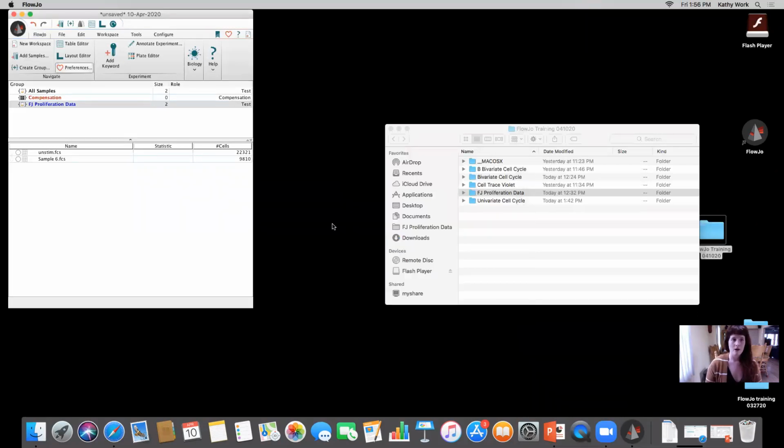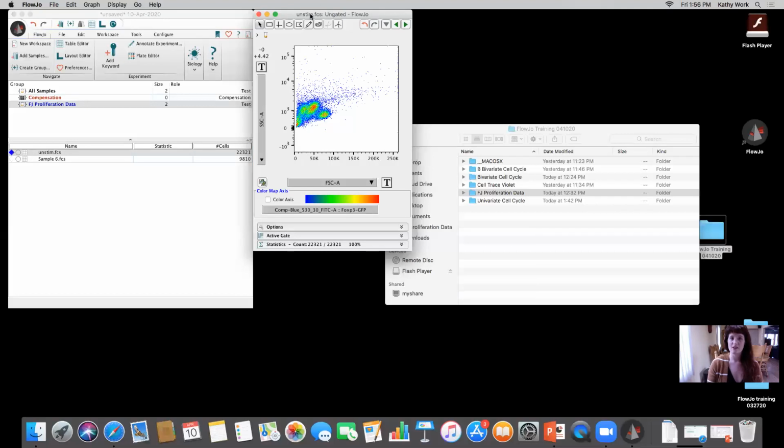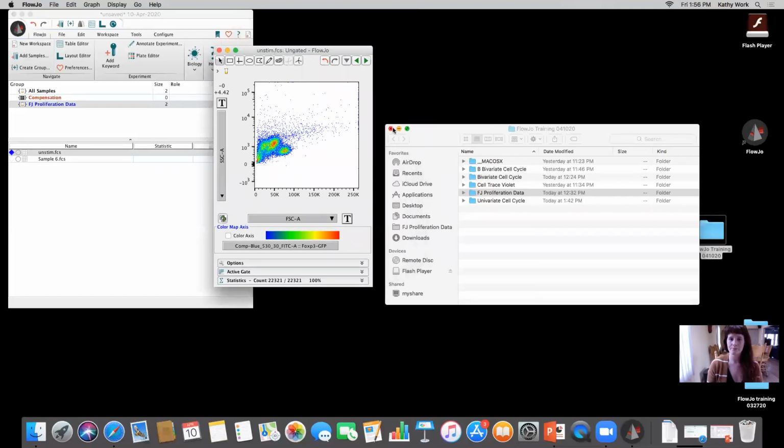Now, once you change those settings, moving forward, it should work out for you. Sometimes when you make changes in the preferences, you have to quit out of the program and open it back up for it to save. I'm not sure that that's the case with annotation off the top of my head. So if it doesn't show up exactly like that, that's why.